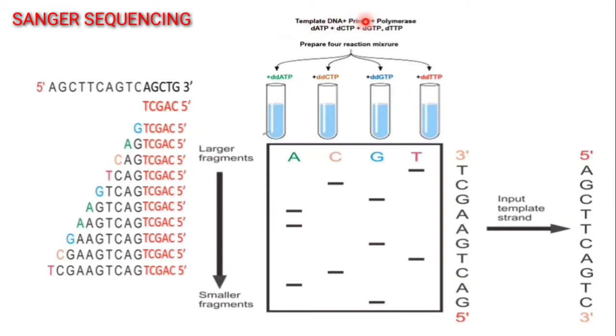You have to remember that the primer should be labeled, along with the DNA polymerase, deoxyadenosine triphosphate, dCTP, dGTP, and dTTP. This is the reaction mixture.